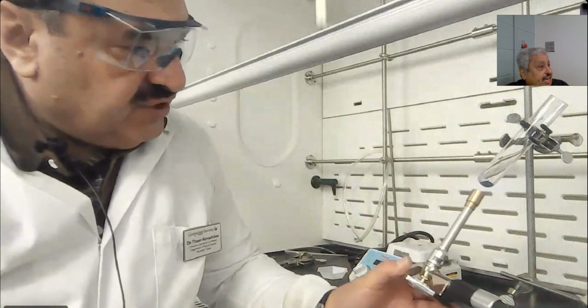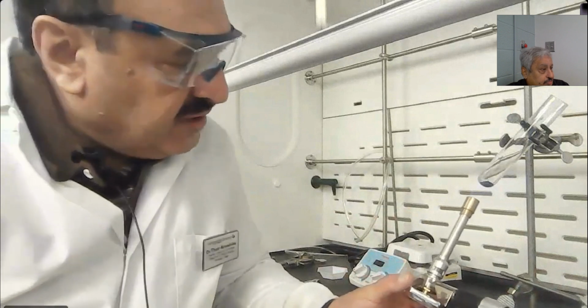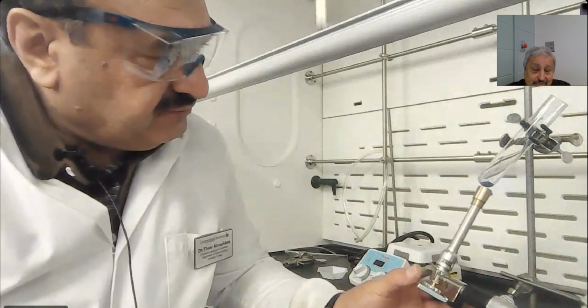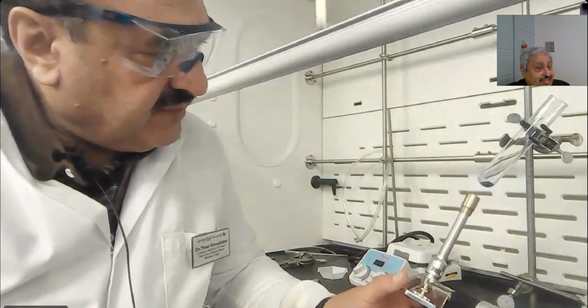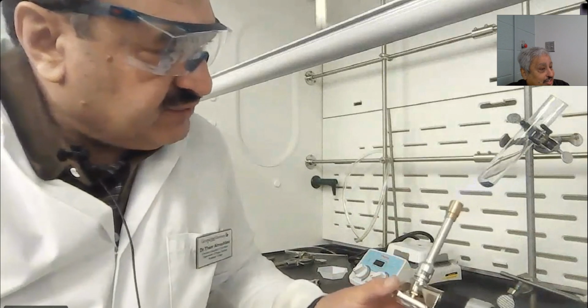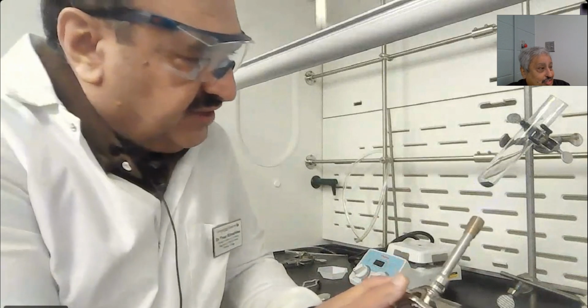I will let you know. Heat the manganese dioxide for 5 minutes. Will not hold it up. Will not touch the flame after 5 minutes, at all. Keep it in one position, cool down also in one position, 3 minutes.